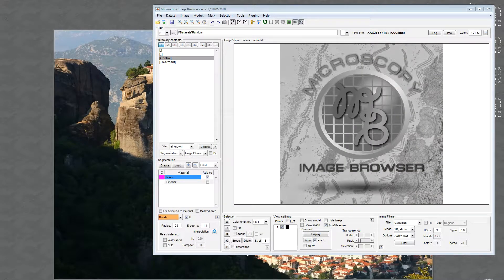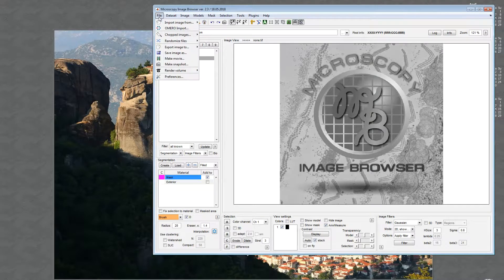Hello everyone. In this video I'd like to show you a new tool which is available in Microscope Image Browser version 2.3, and it is located under the menu File > Randomize Files. There are two tools which I'll explain in this video.